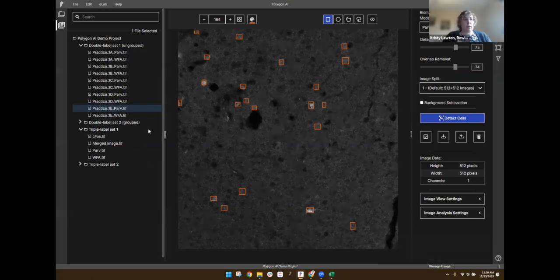And the reason I'm doing this is because we require a minimum of 5 images to start to train a custom model. We recommend starting with at least 10, but we have had success training with as few as 5. And really this depends on how big your images are and how many objects are in your images. If you have a giant image with thousands of objects in it, then you can split that up into several smaller images. You don't have to train with 5 giant images.